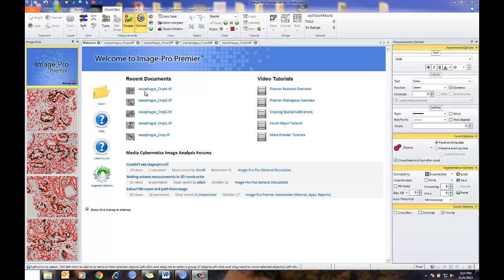The key to setting up Learning Classification is to have an image or a set of images which contain representative samples of the various classes. Once the classification is set up and saved, we can use the classification scheme over and over again, whether counting a few images, used in batch process mode, or in a macro. To learn more about count and size features, please see the related videos on count and size. Let's get started.